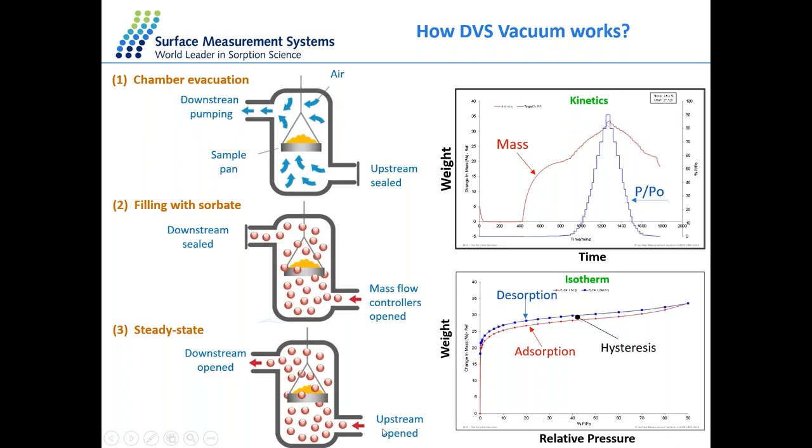So we get a continuous flow of water molecules over the sample while we continuously record the changes in the mass. This is very important because traditionally in volumetric systems, this is done with the static method. You just inject molecules and wait for equilibrium using Brownian motion, whereas here there is a flux of molecules. As we do this, we continuously flow the molecules over the sample.